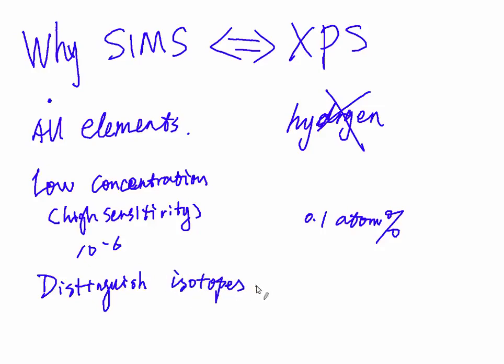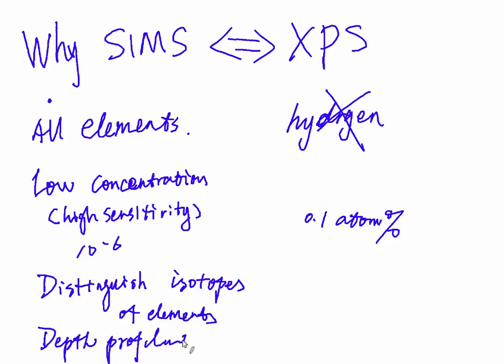The fourth is that SIMS can do depth profiling, while XPS can just detect the surface.